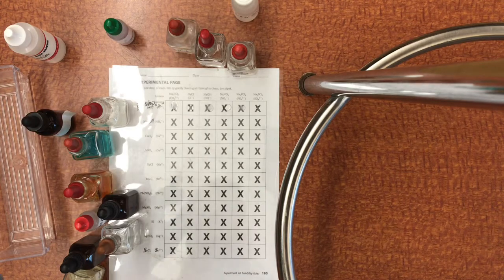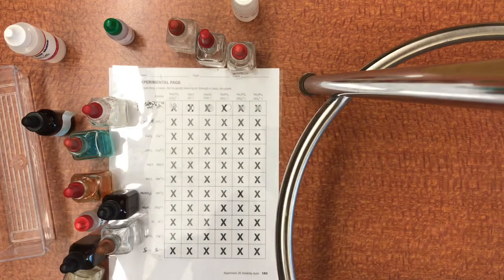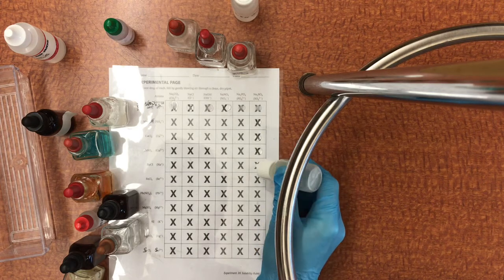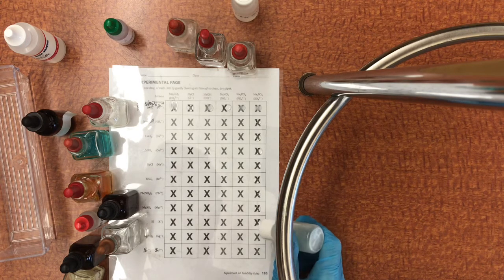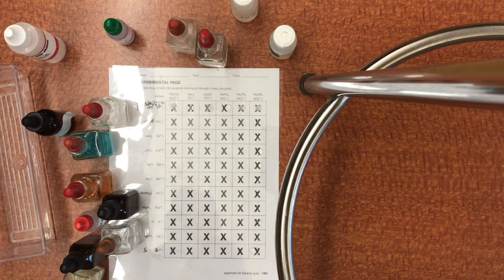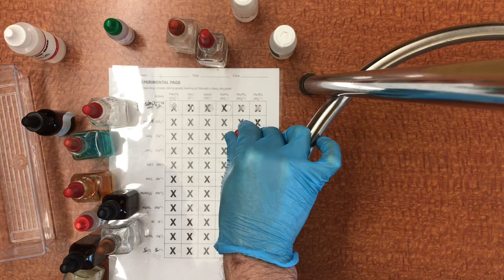And now let's see if the sulfate is also insoluble. Yeah, that one's very insoluble. So you can see that distinct reaction forming there. Okay, so maybe let's see if we can save ourselves a little bit of time by putting a drop down the row here. Okay, so there's my sulfates. You know, doing this quickly is probably not actually going to pay off, is it?